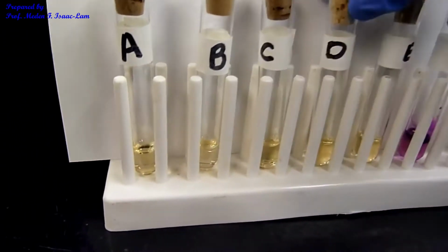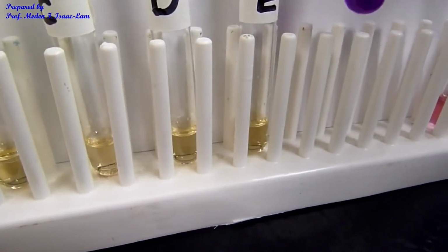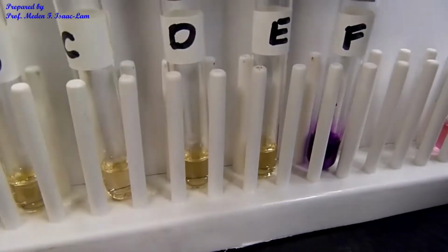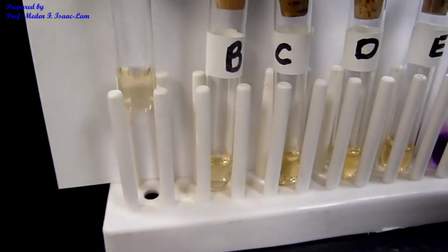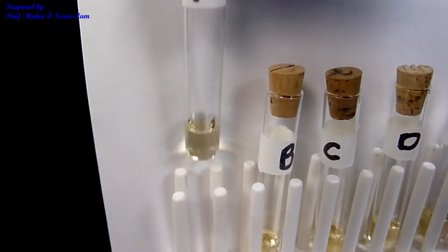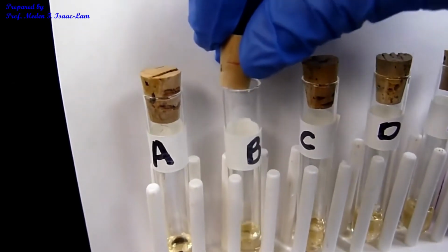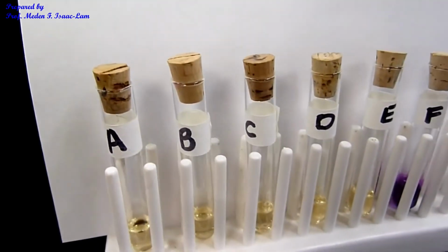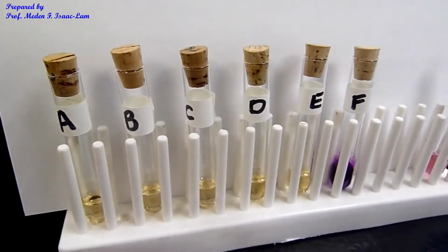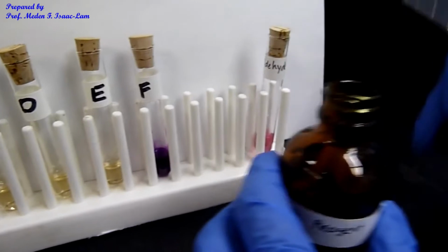So now if you compare, F is intensely magenta color, while A, B, C, D, E did not change color. So you see A, no change in color. B, no change in color. It's the same color as the reagent. So that's just reagent.